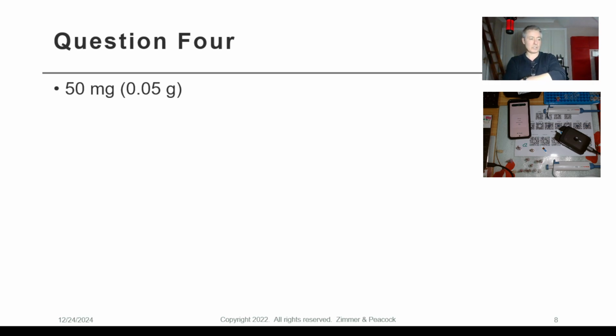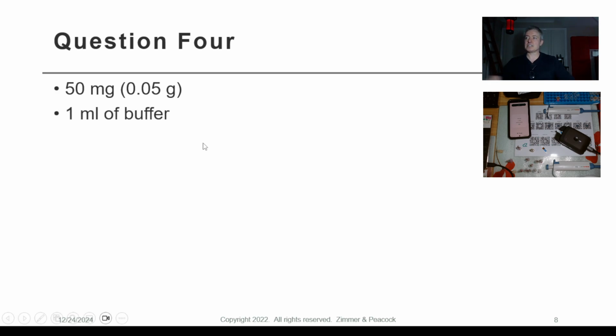There's a difference because we're trying to understand the caffeine in many samples, but we're going to start off with the more traditional caffeinated materials like coffee, which is obvious, and also tea. But the way we're expecting to run this is 50 milligrams of the coffee or 50 milligrams of the tea leaves. I'm being very specific here, and I'll give you a quick demonstration in a minute. But that's diluted in 1 ml of buffer. So that's the way we're expecting people to do sample preparation.